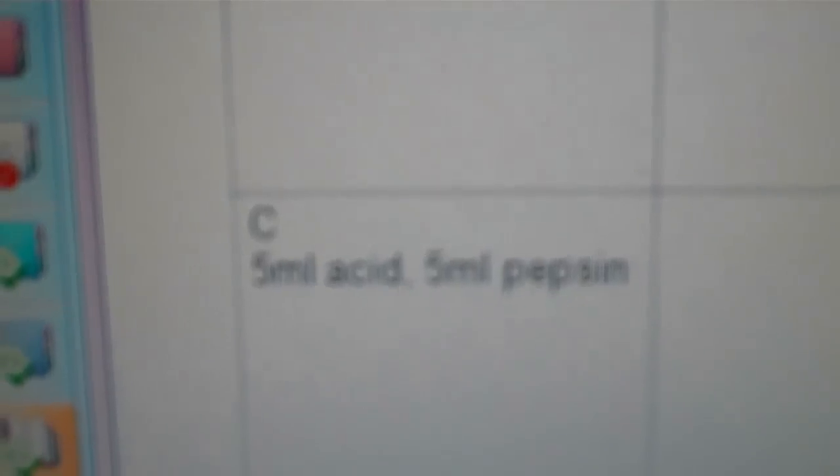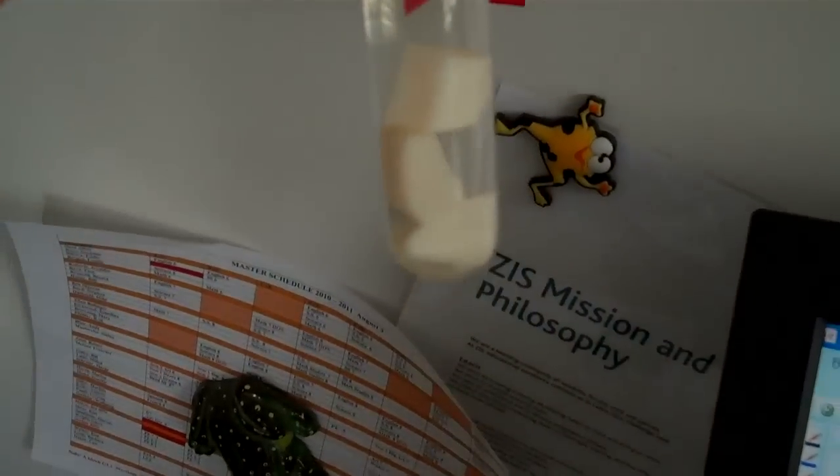And test tube C, we're going to have five mils of the hydrochloric acid found in the stomach, and five mils of pepsin, the enzyme pepsin, plus the three pieces of egg. And the enzyme pepsin is the enzyme that digests protein. So we're going to leave these pieces of egg white.